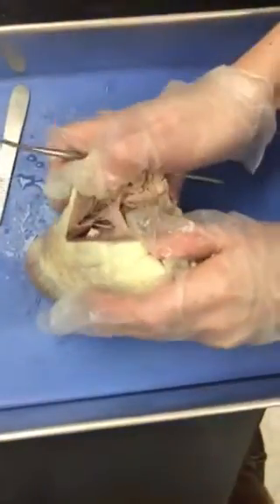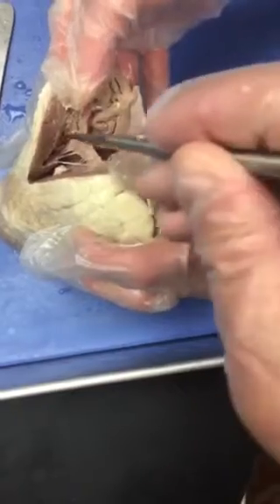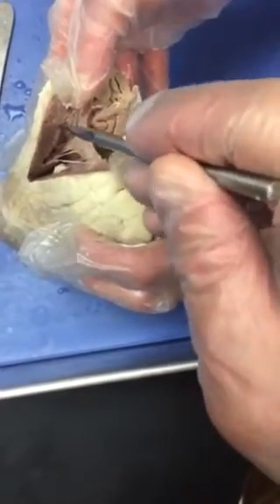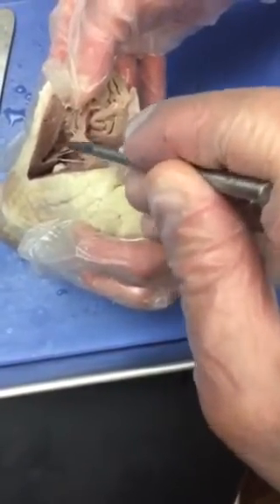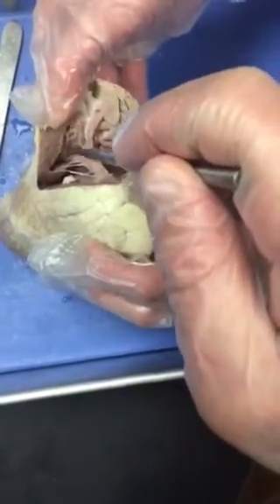32, observe the fibrous cords that are attached to the valve and help hold it in place. These are called the chordae tendineae and they extend to the right ventricle. The chordae tendineae are attached to the papillary muscle, which hold the fibers of the wall of the ventricle. Both the chordae tendineae and the papillary muscle are essential for the valve to work correctly.